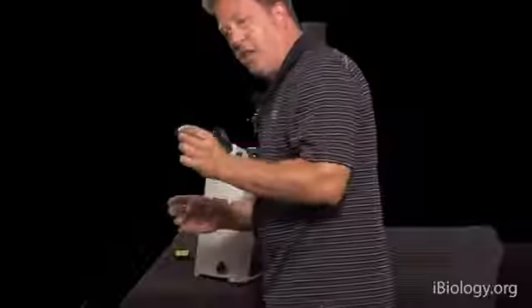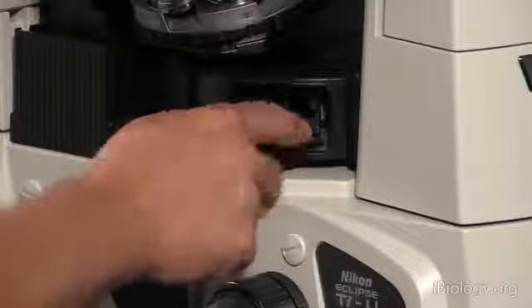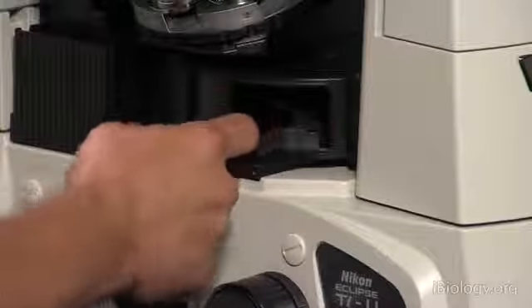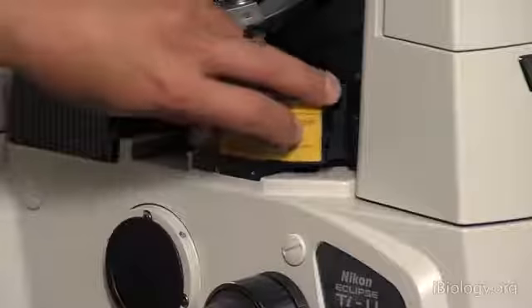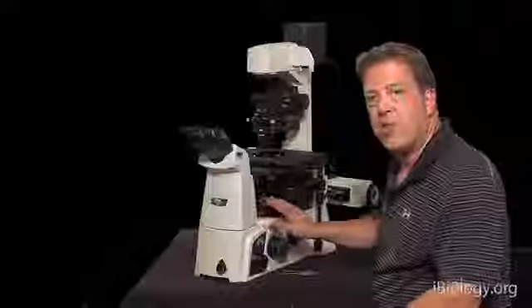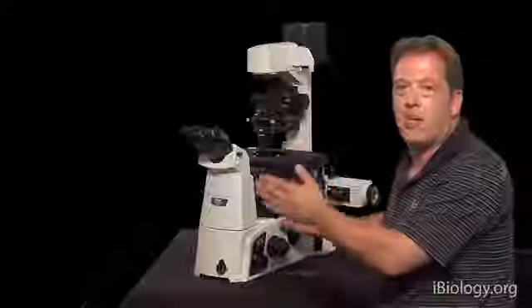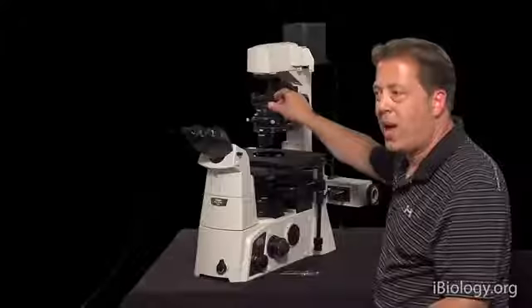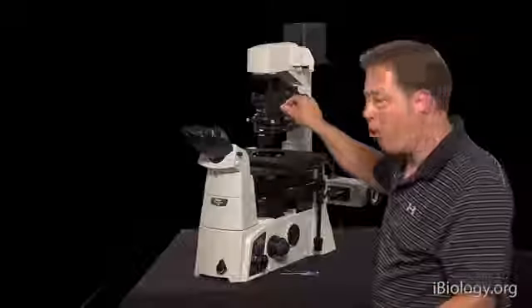And the analyzer, or second polarizer, goes into our fluorescence filter turret, and it clicks in place, and then 2 clicks to the left, and it is in our light path. The analyzer sits there so that you could do multidimensional imaging and switch between DIC and fluorescence imaging. So now we have these two polarizers in place.